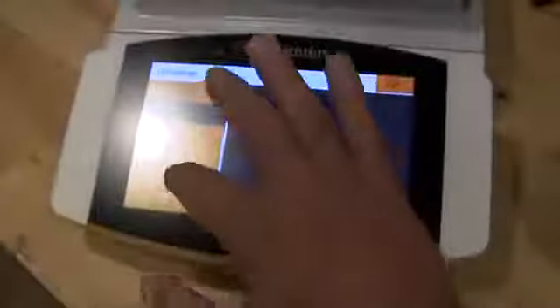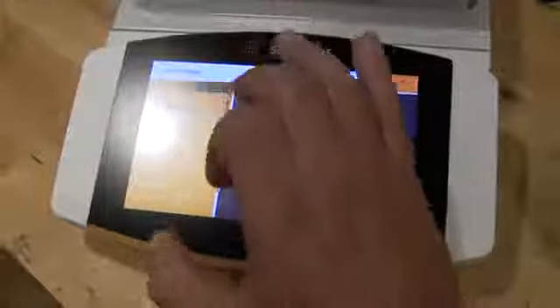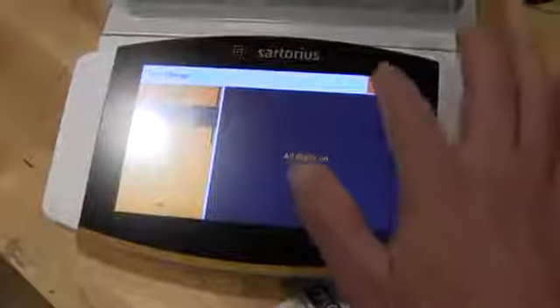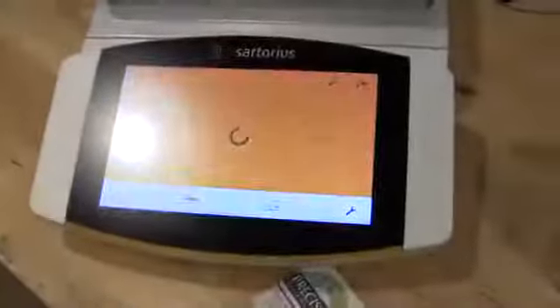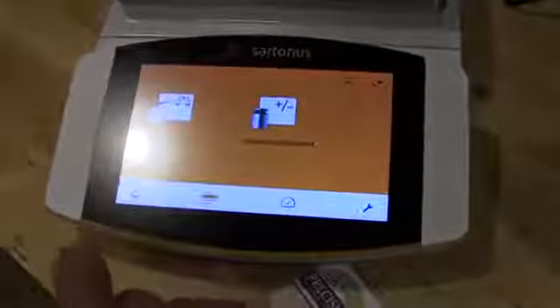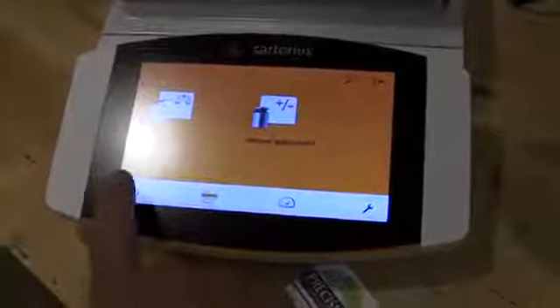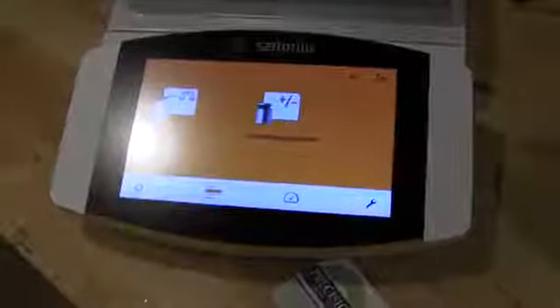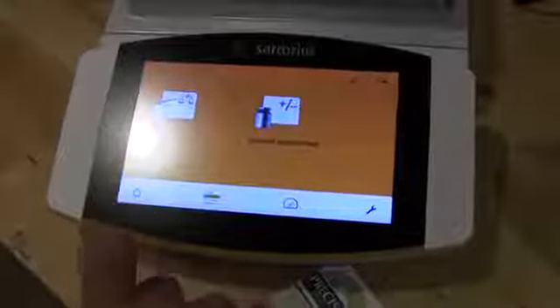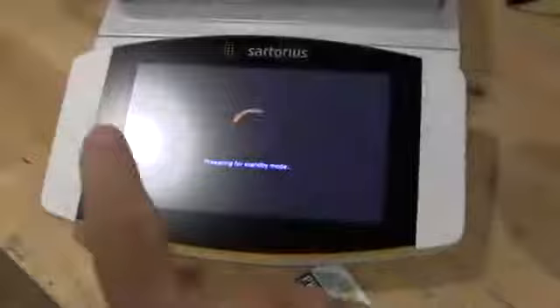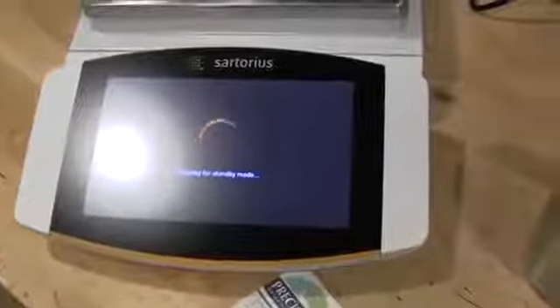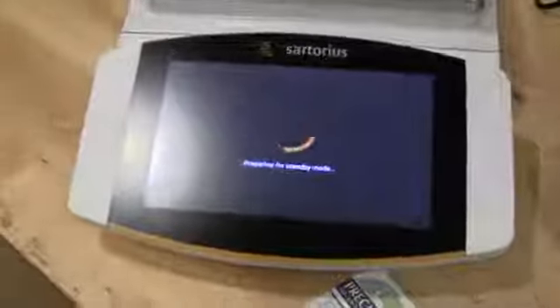And if I go in here, we've removed those weigh units. Let me power down the balance. You'll notice the touchscreen, it's just a simple touch of the button. You don't need to press on. This is a touchscreen altogether, just lightly tap.